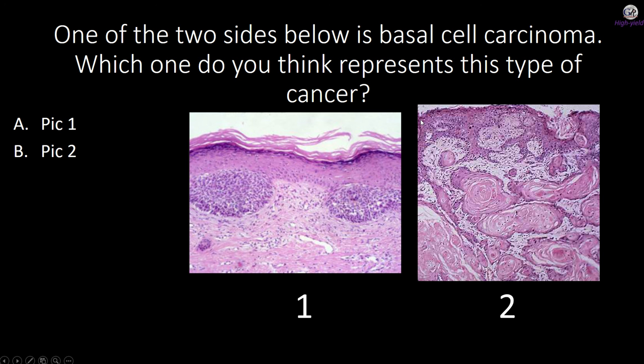Let's just pretend here that this looks like the surface and the stratum corneum. But these big patches, they don't have nuclei in them. These are actually big patches of keratin that is kind of filling up this section. So I actually think this might be carcinoma that are a part of the stratum spinosum.